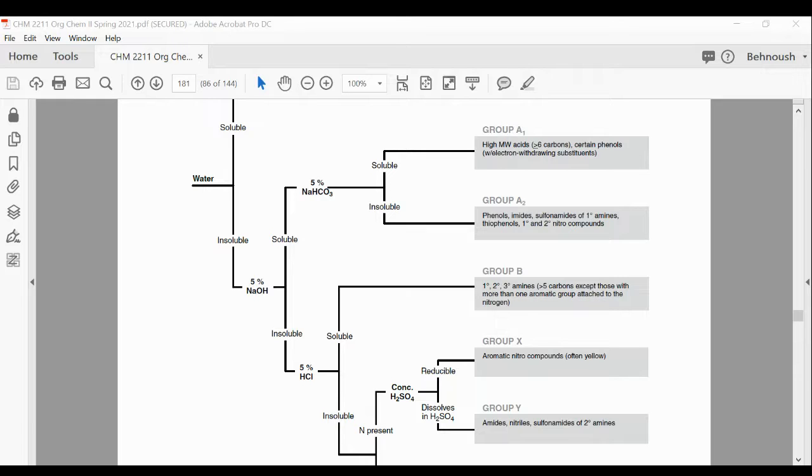Or I make it easier so you type less. Which one would dissolve in sodium bicarbonate? And which one doesn't dissolve? The acid would dissolve in sodium bicarbonate, but the phenol does not dissolve, right? So if you have the test tube that you think is one of the two, you are going to add sodium bicarbonate. If it bubbles, basically sodium bicarbonate is going to react with benzoic acid, is an acid-base reaction, and is going to produce carbon dioxide gas, and it bubbles.